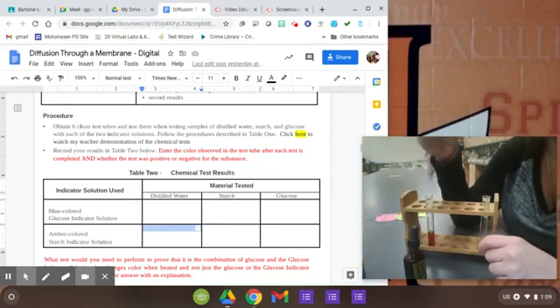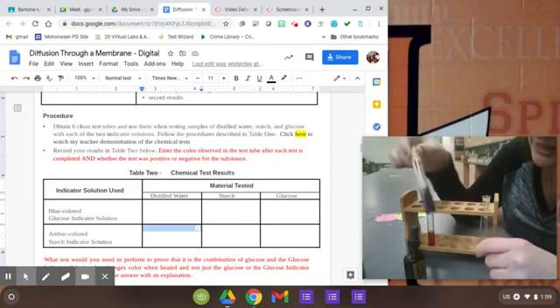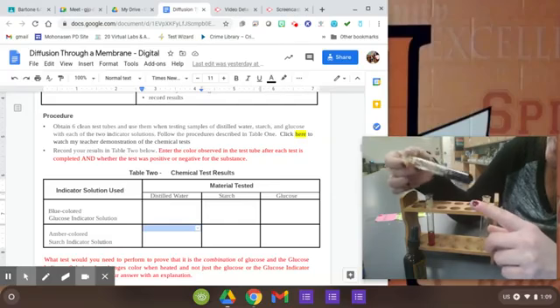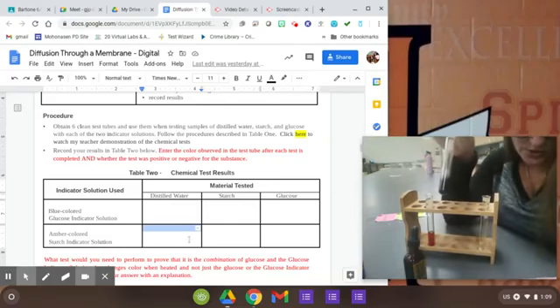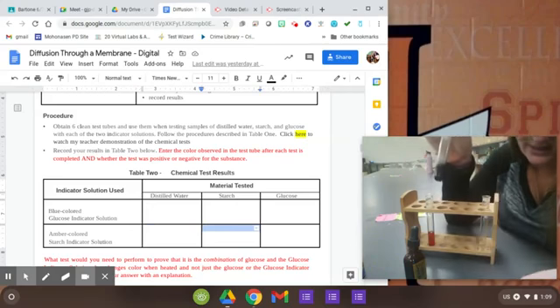Usually this is a little bit closer to a greenish black. It should turn what we call a blue black. It's almost like a really, really deep purple. But this one happens to be just really black. So for starch with starch indicator, which is this box, you're going to put positive reaction, and that it's black.